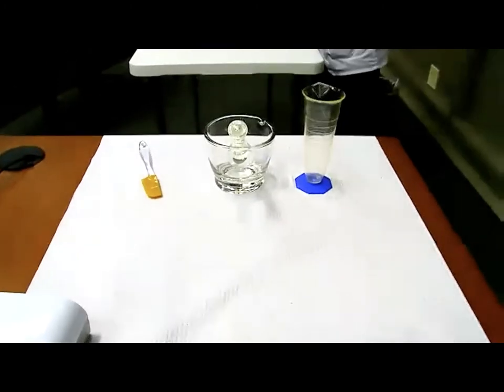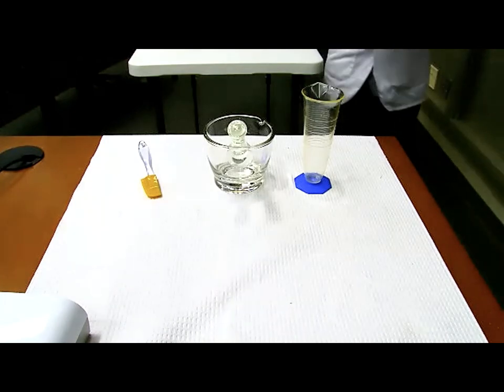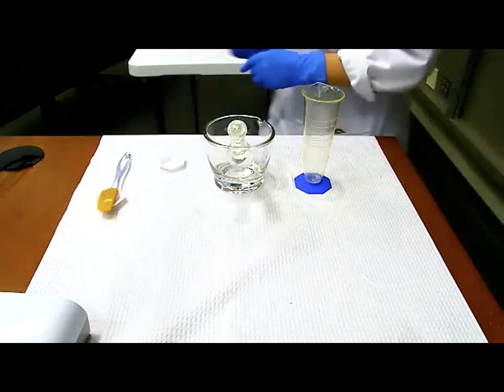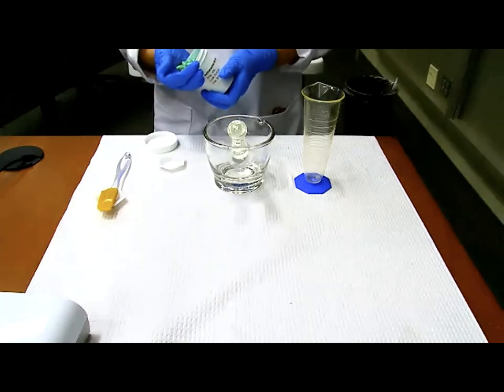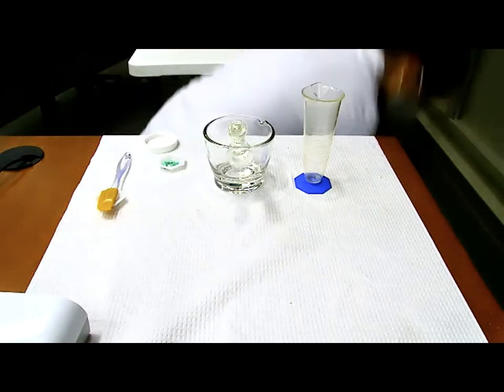Before Judy goes to work here, let me just point out a couple of things on your compounding record. Look on your procedure. A couple of key terms I want to point out is step 3. It says to wet the capsule powder. This is the key step to avoid clumps. So circle the word wet. It's extremely important when Judy does this. You watch her carefully. That is the key step to avoid the clumps, wetting the powder.